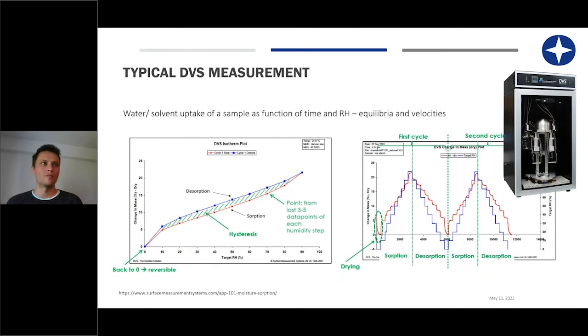So that works, perfect. I'd like to start and have a look with you at something you are certainly aware of if you are working in the field of DVS measurements. If you are aware of DVS measurements, you certainly know these kinds of diagrams. In the development of a new formulation of a new drug, we often characterize how much water is absorbed at a certain relative humidity after a certain time. And a typical characterization method in a DVS is, for example, the one which is shown here.